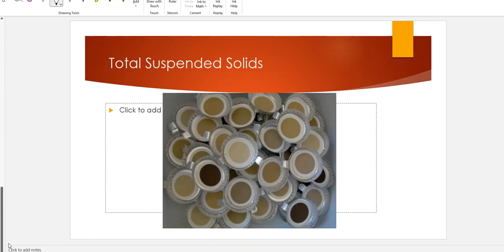So just some visuals and some cues on what you're getting ready to see in the laboratory for this particular day. And again, we'll demonstrate how to process a sample both with a 160.1 and 160.2 combo, as well as a sample of just straight up 160.3, so that way you can see the difference a little bit better.